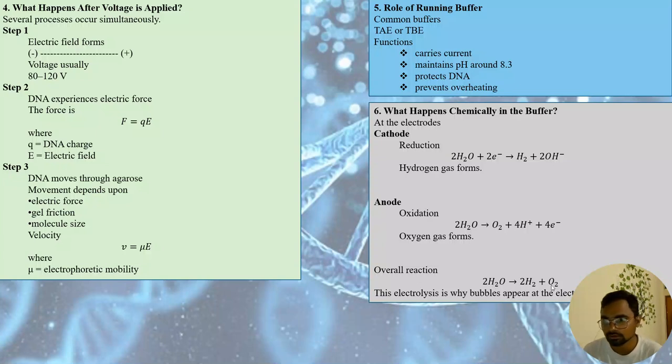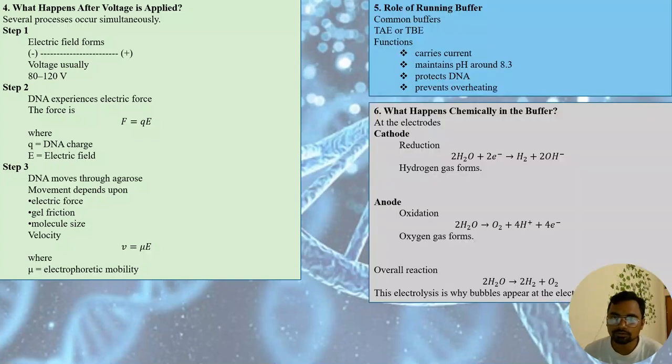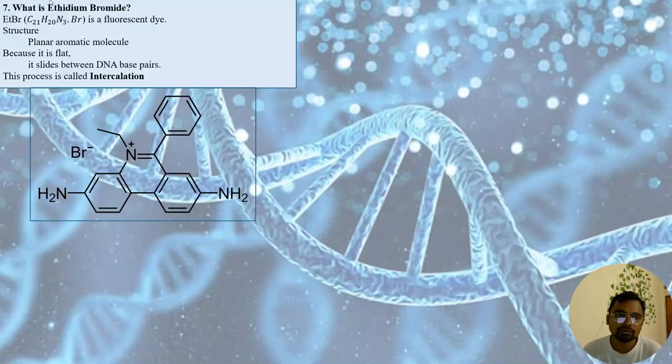So overall, water is split into hydrogen and oxygen. Bubbles will appear during electrophoresis.